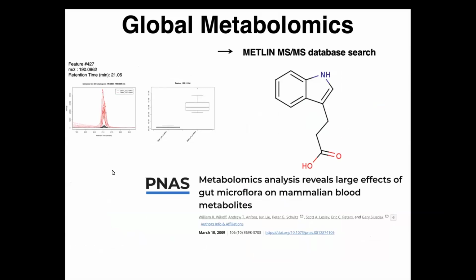This molecule was observed originally in a set of experiments that we did in collaboration with Pete Schultz. Pete initiated this whole study when he was at the Genomics Institute of Novartis. To me, it was a really insightful approach to doing metabolomics in a way that had been extremely novel at the time. The proposal was to identify molecules associated with animals that didn't have a gut microbiome and those associated with animals that did have a gut microbiome. So it was a comparative analysis between the two.